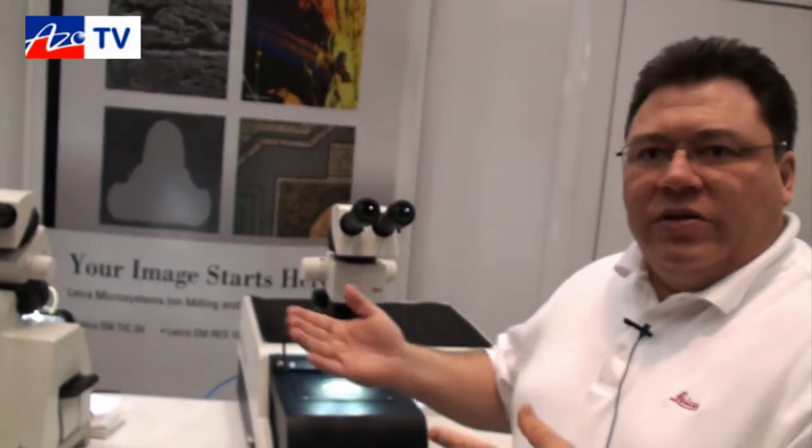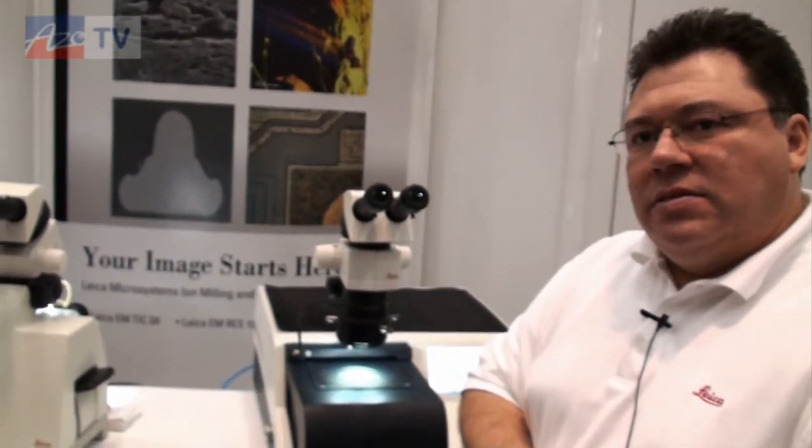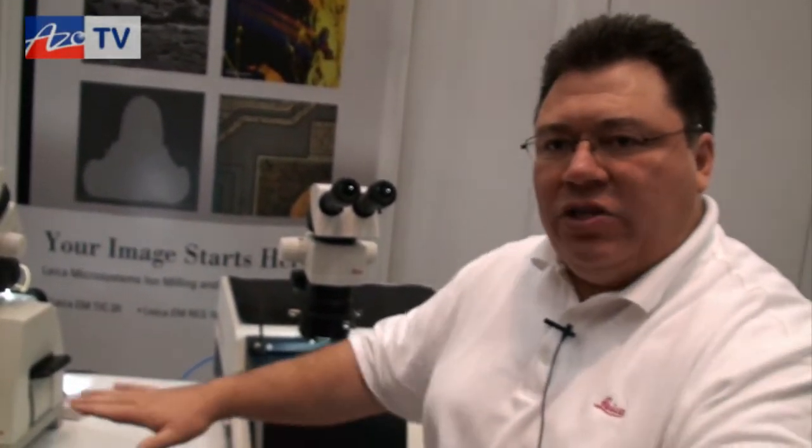It's good for metallography — absolutely, they can bring their samples and get really nice surfaces and then do their analysis. With the TXP, the fact that it's all in one instrument — does that make it easier to use and produce better results? Much, much easier, because again the traditional way is to have a whole bench of systems; you have to saw cut it with a saw, take it to the grinder, and then of course take it to your imaging system.